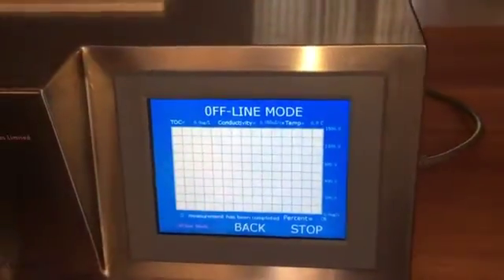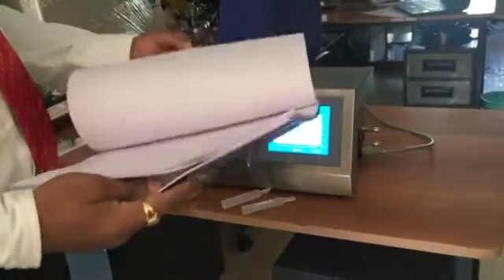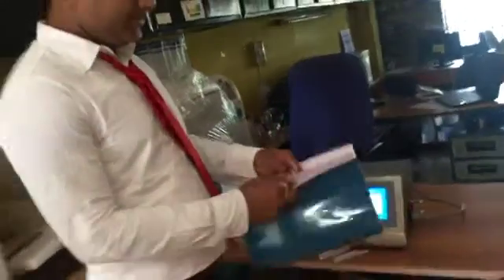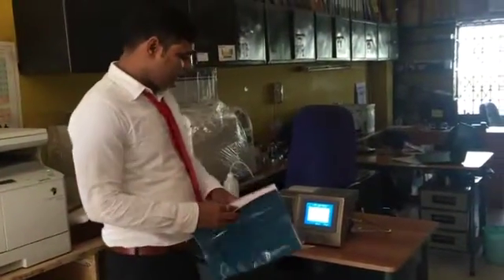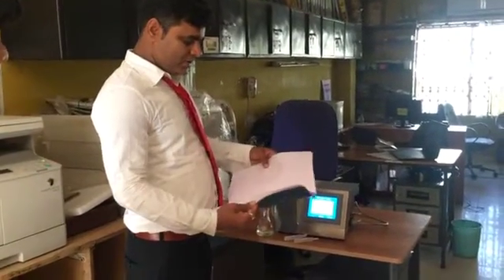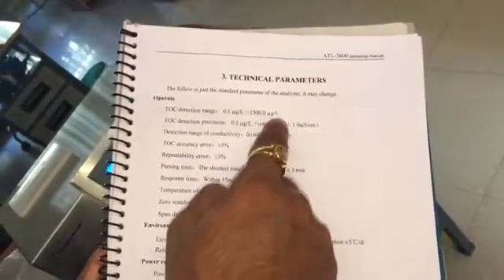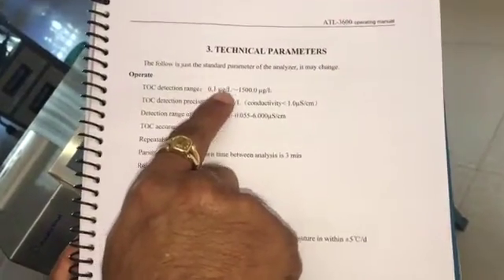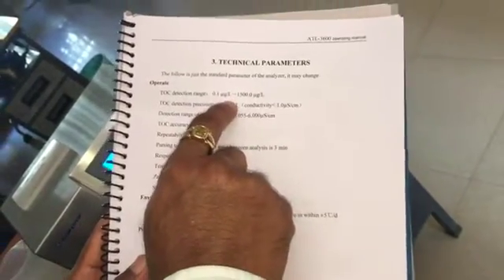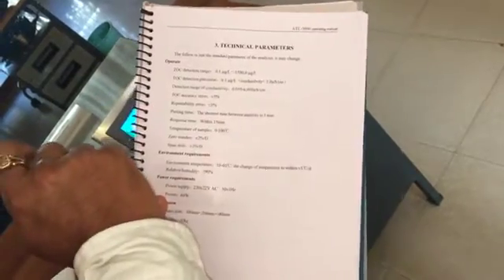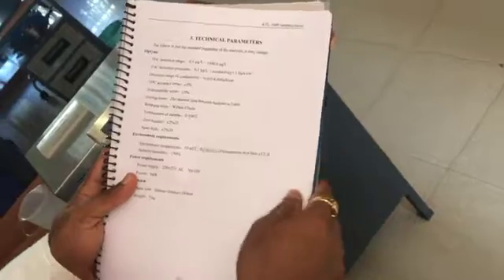This machine can measure from 0 to 1500 ppb. Looking at the manual, you can see the specifications: 0.1 micrograms per liter to 1500 micrograms per liter — that means 0.1 ppb to 1500 ppb (micrograms per liter equals ppb; milligrams per liter equals ppm). The precision is 0.1 micrograms per liter.